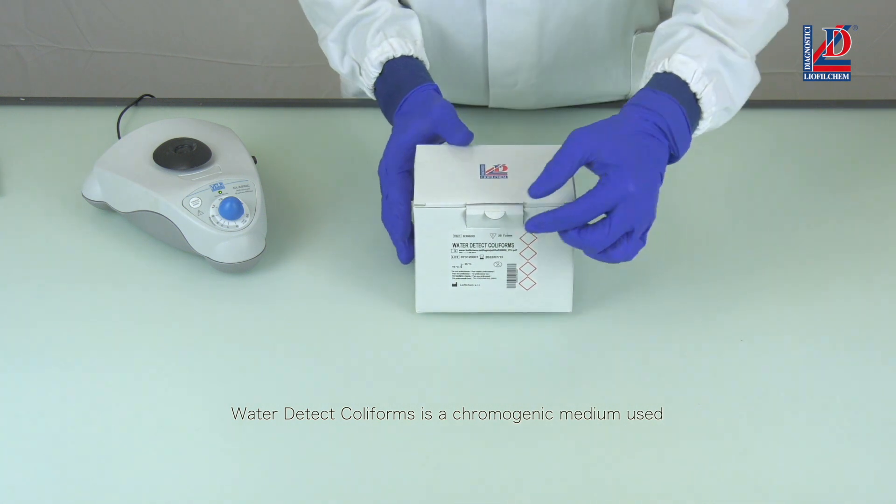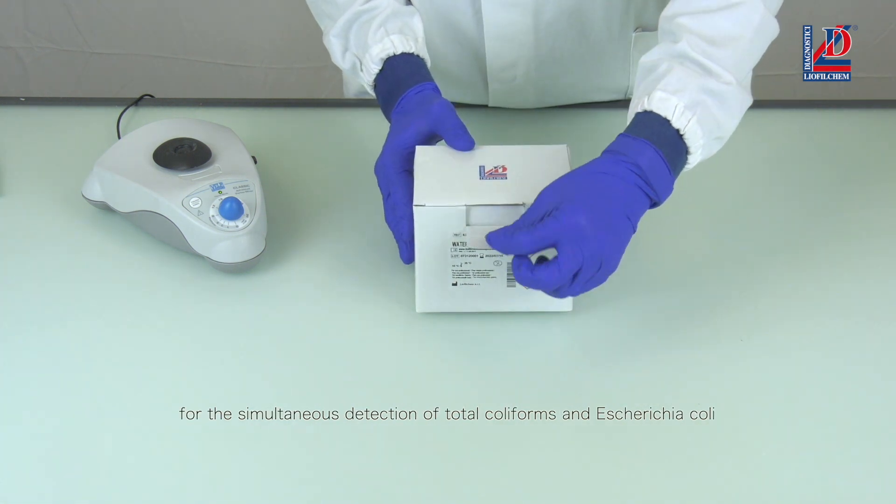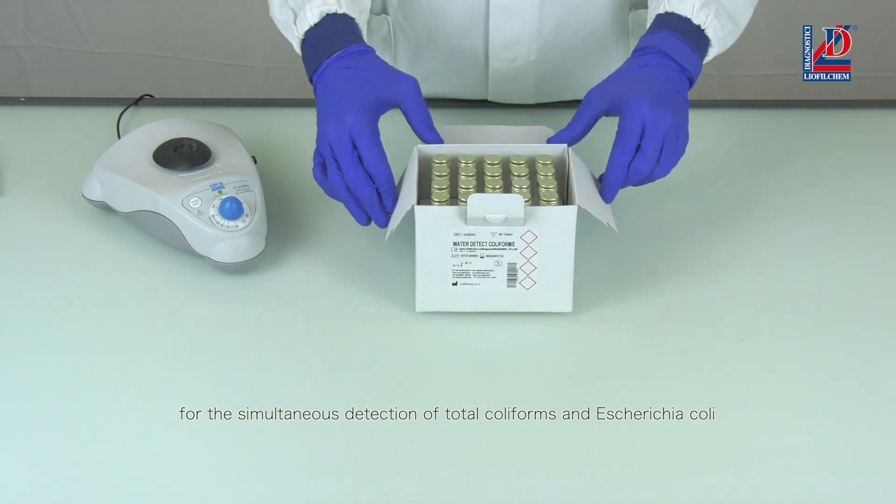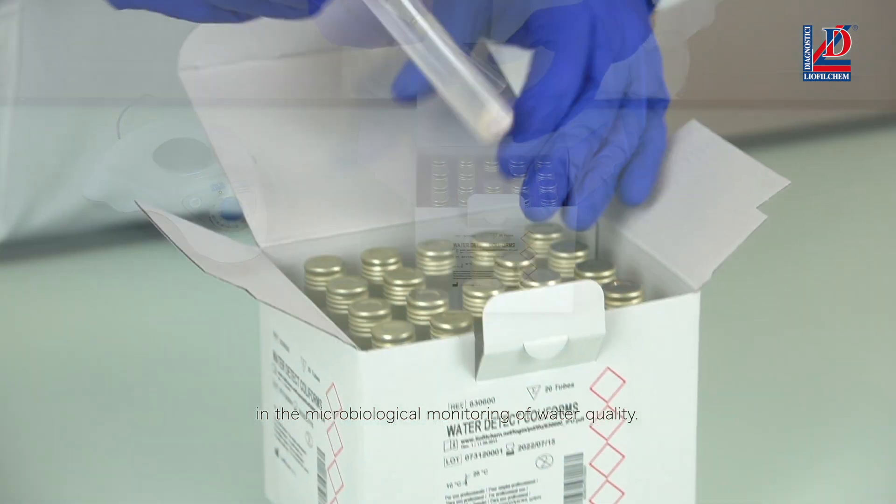Water Detect Coliforms is a chromogenic medium used for the simultaneous detection of total coliforms and Escherichia coli in the microbiological monitoring of water quality.